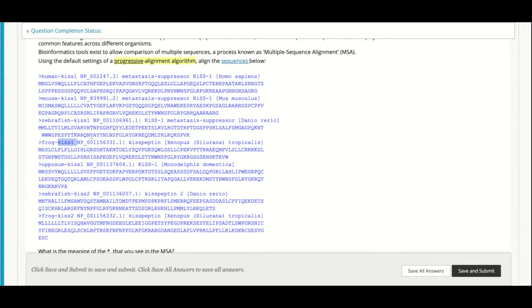All right, so how do I compare them? You will open a new window, and I'm just going to type Clustal. And let me see, is it sharing? Oh, okay. Let me share the next window with you.